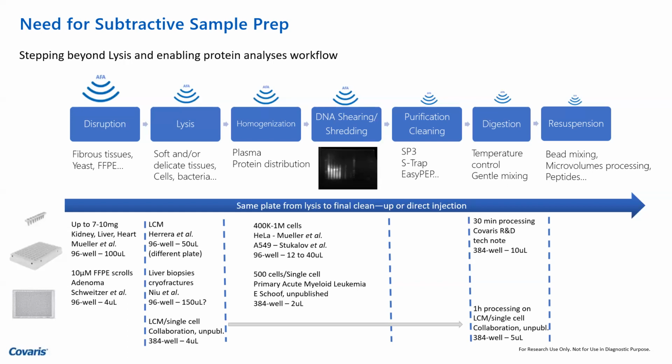In most cases. There are lots of scenarios where IgG is looked into. So what people do in scenarios like that, and he can do a much better job in explaining protein depletion, I'll try, is that you have an ocean of proteins that has come out of a tissue.